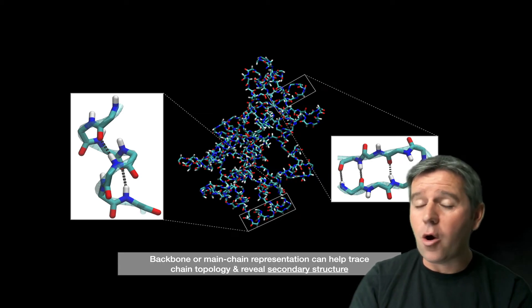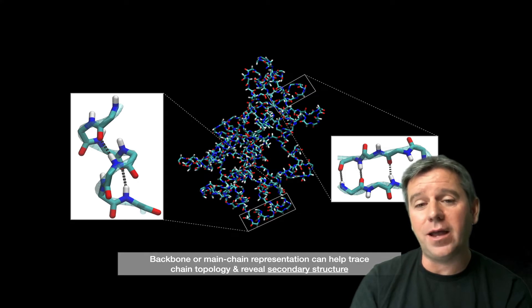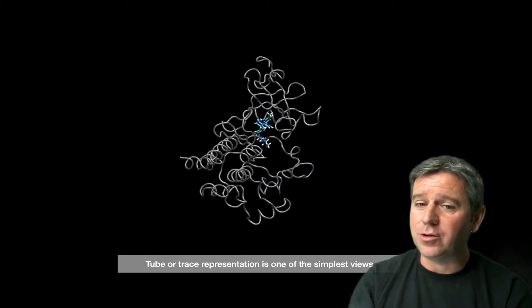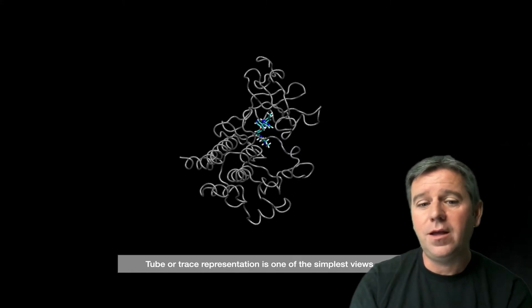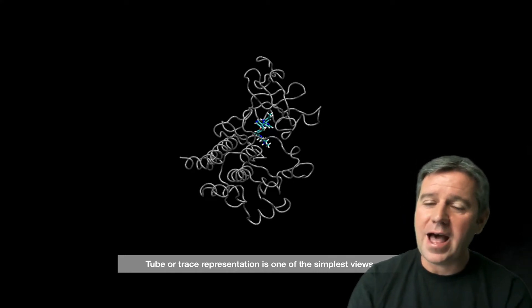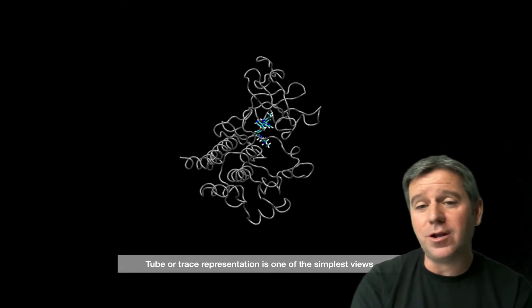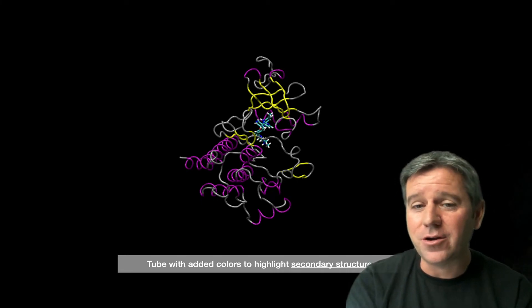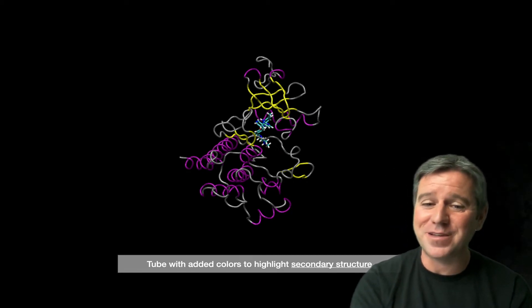I'm going to turn off all but one atom per amino acid — just the C-alpha atom — and draw a C-alpha trace through the protein. This is one of the simplest views of a protein. I'll then add color information: alpha helices in purple, beta strands in yellow, and the loops that join these secondary structure elements together in gray. These loops form the connections between secondary structures that give rise to the tertiary structure.